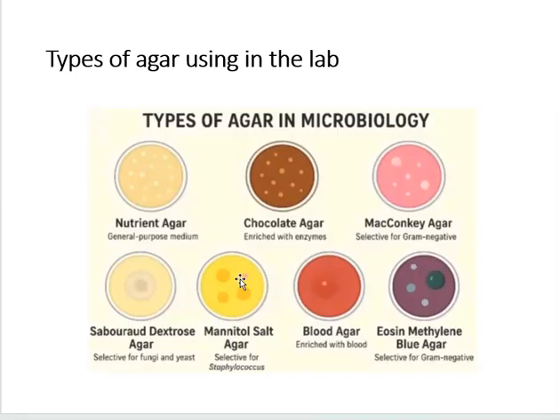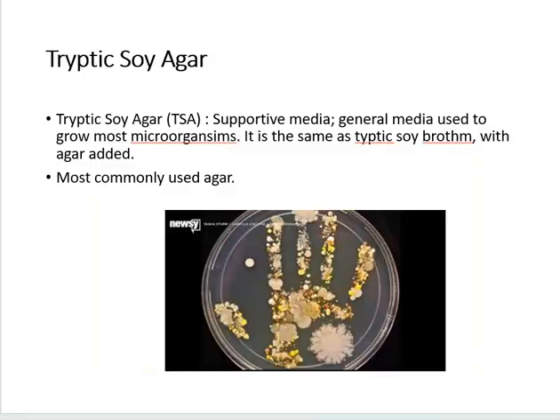So, we can look at the plate, everything goes out on the nutrient agar, and then we can look at the MacConkey agar. If that's blank, that means whatever's growing is gram-positive, and vice versa. So it helps us differentiate these quicker and get a pure culture, which we need to do antibiotic sensitivities, by the way, and identifications. So let's look at our tryptic soy.